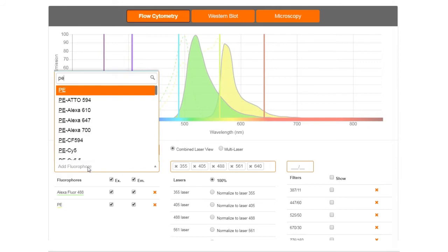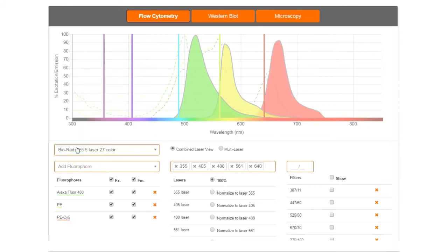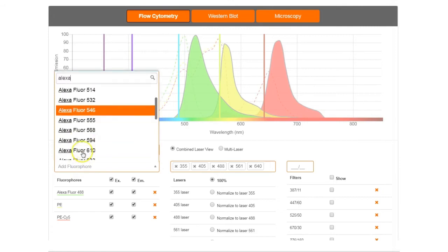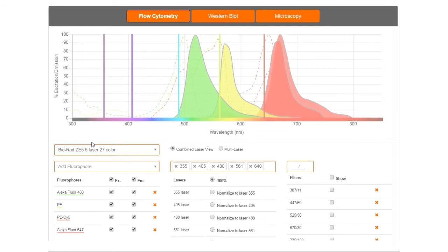In this example, the emission spectra for Alexa Fluor 488, PE, Alexa Fluor 647, and PE-Cy5 can be seen. The emission spectra of Alexa Fluor 647 and PE-Cy5 overlap, but are excited by the 640 and 561 nanometer lasers respectively.